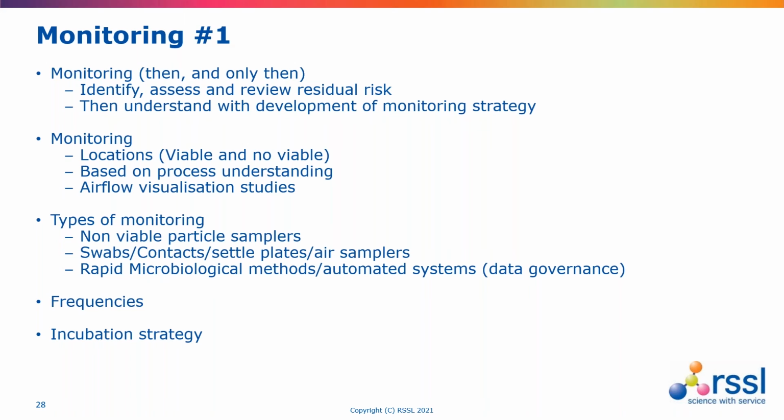These help us guide the types of monitoring, as I've already alluded to, and also where rapid microbiological methods might be of benefit as well. And also we need to then set appropriate frequencies and have a defined incubation strategy.